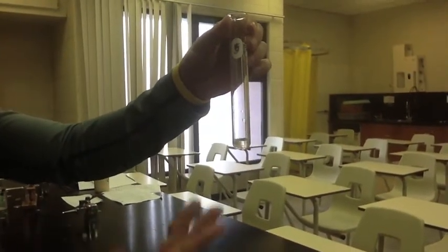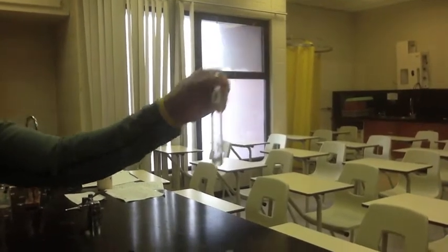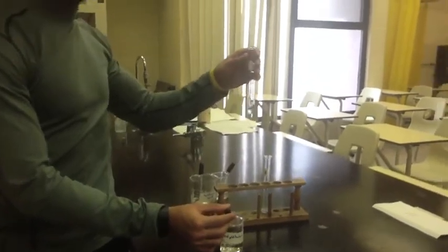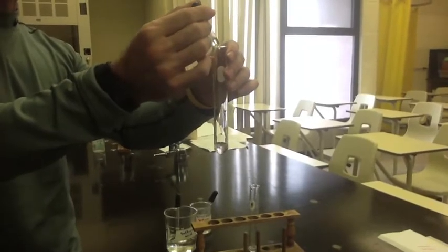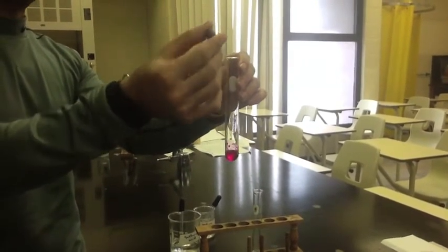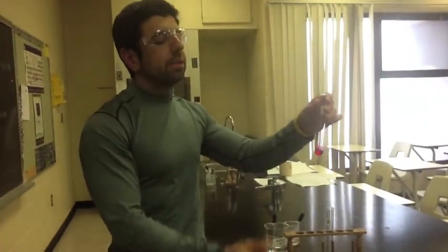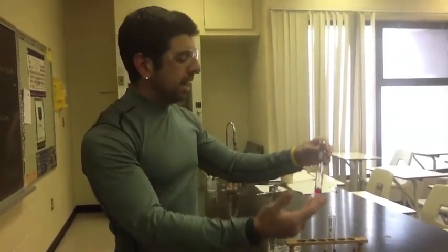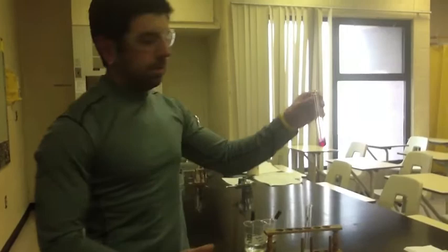So in an acid, that's what phenolphthalein will indicate. When we put it into a base, into yet another clear and colorless liquid, watch this one carefully. And that's all we really need, because that's really the color that we want. We stir that up, right? Notice that fuchsia, magenta, whatever color you want, pink, my students like to call it. So notice there how phenolphthalein indicates in acids or in bases. In a base, as we have here with the sodium hydroxide, there's the color.